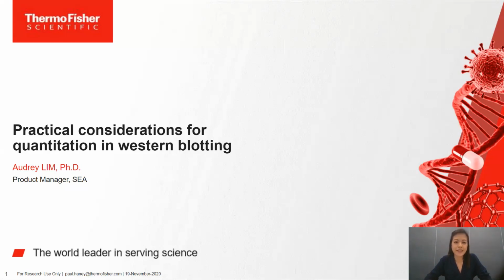My name is Audrey, and I'm the product manager covering the protein analysis portfolio in the Southeast Asia region. And so today, for the second topic, I will be taking you through practical considerations for quantitation in Western blotting.